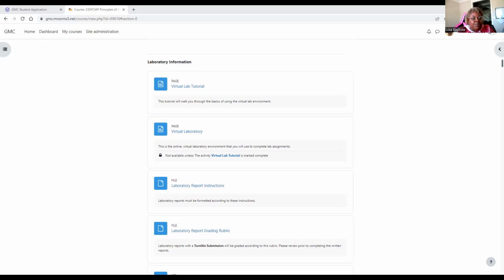So now the next thing we want to do is add our solid to our graduated cylinder. And so we're going to take our solid, go over to the graduated cylinder. When we see that dotted line, then we release it. We know the precise amount that we have. So we know that we have 5.6752. That's our grams, and we want to pour it in there. Okay. And so now it's been transferred.